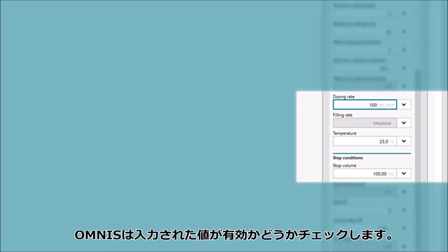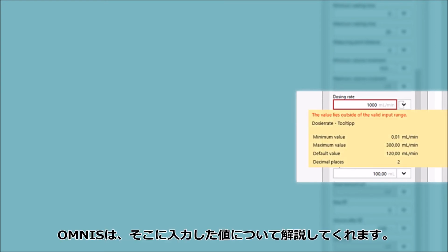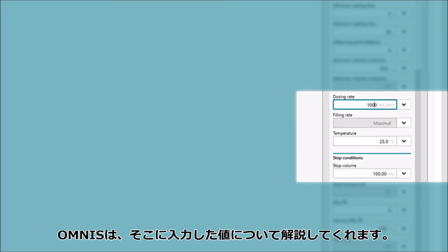When you enter data on the OMNIS user interface, OMNIS checks the validity of your input. OMNIS actually warns you if your input fails this check. Even better, move your mouse over the field in question, and OMNIS helps you to enter valid data.